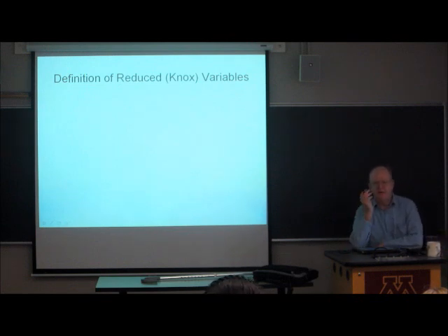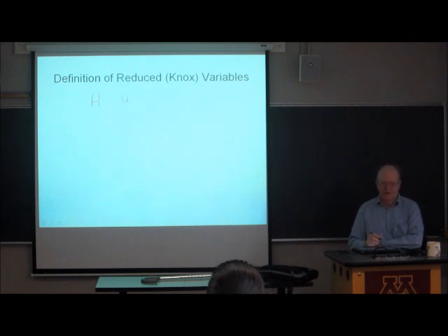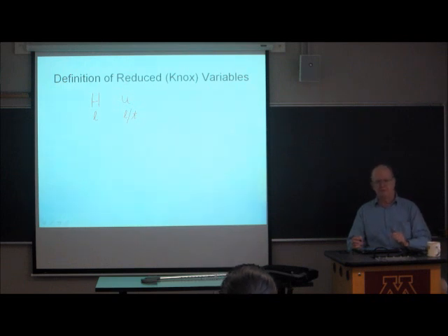So the two primary variables when we're thinking about the relationship between HETP and speed, velocity, are H and the velocity. H has units of length, and velocity has units of length per time. So I can say that this way. This is L, and this is L per T. These are dimensioned quantities. It turns out that it's actually much more useful, both theoretically and for practical purposes, to work with what are called dimensionless coordinates.